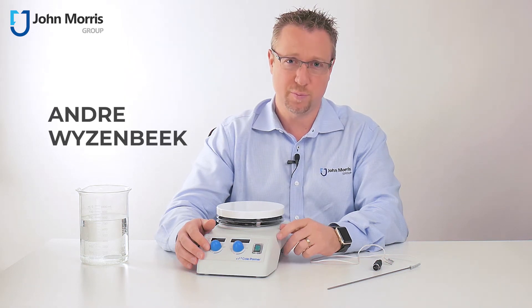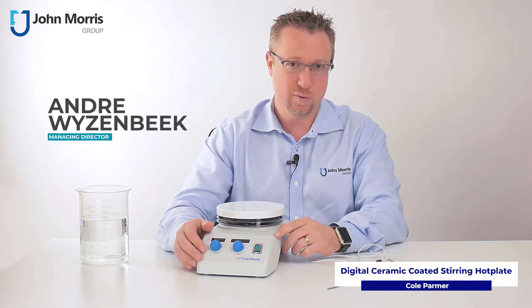Hi, I'm Andre from the John Morris Group. Today we're doing a product review on the Cole-Palmer Digital Hotplate Magnetic Stirrer.